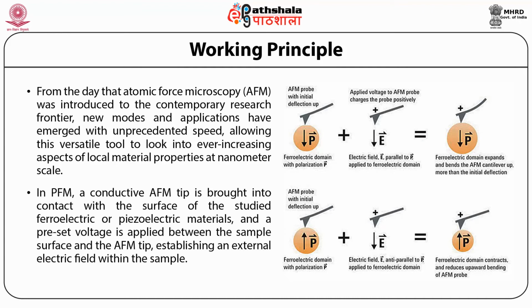In PFM, a conductive AFM tip is brought into contact with the surface of the studied ferroelectric or piezoelectric materials, and a preset voltage is applied between the sample surface and the AFM tip, establishing an external electric field within the sample.